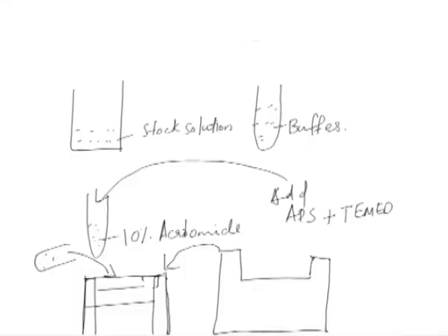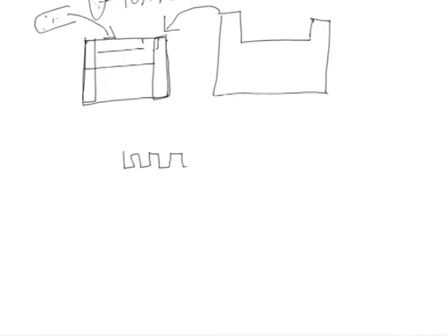Now, before, as you have poured this, you have to put in combs. Again the combs, as I have shown you in agarose gels, this comb will be put in here, and this comb will create the wells in the gel, so that you can load your samples. All right. So, let us go back to our discussion.